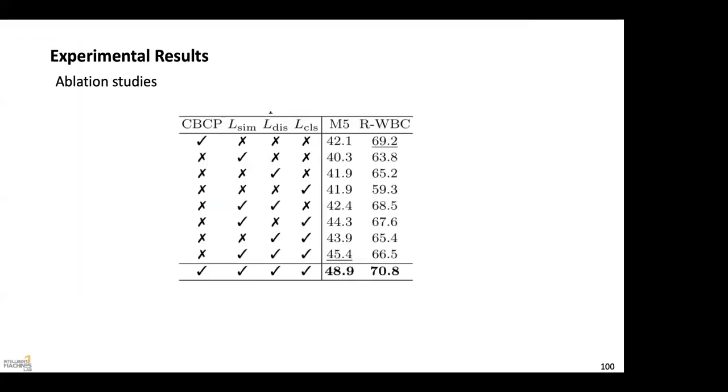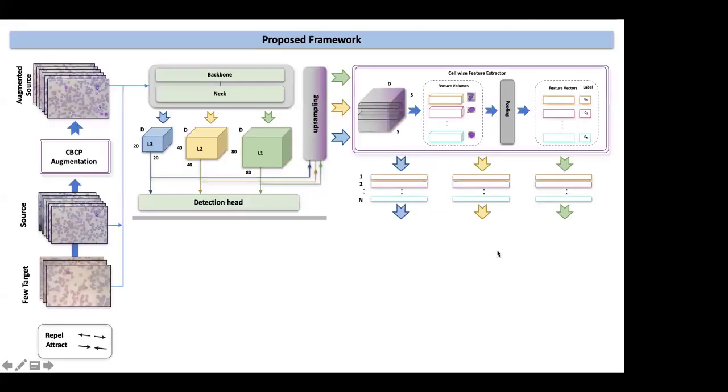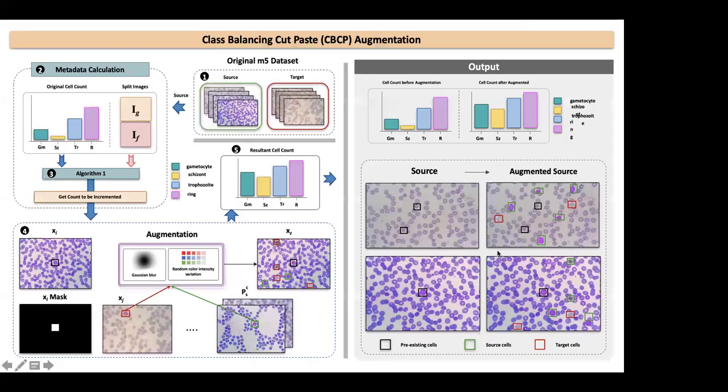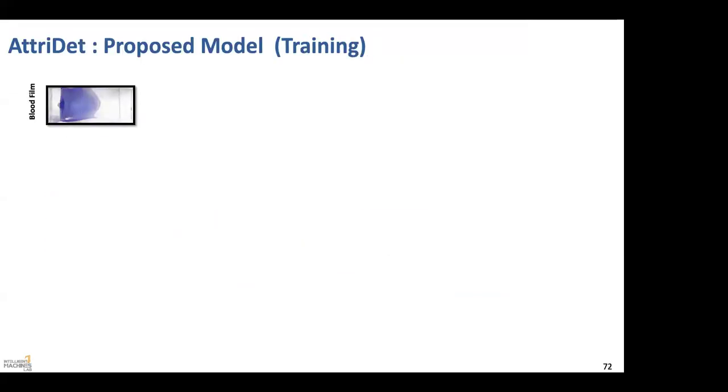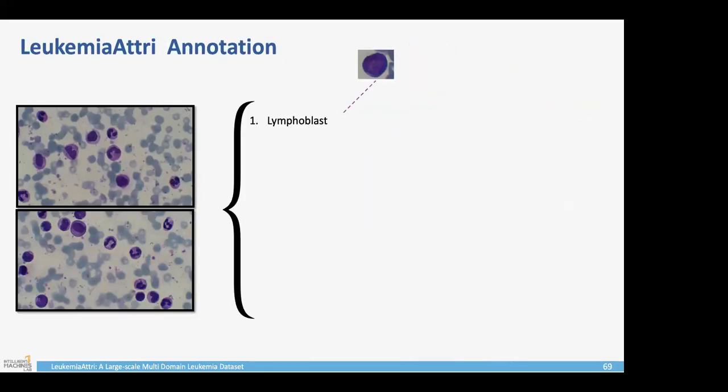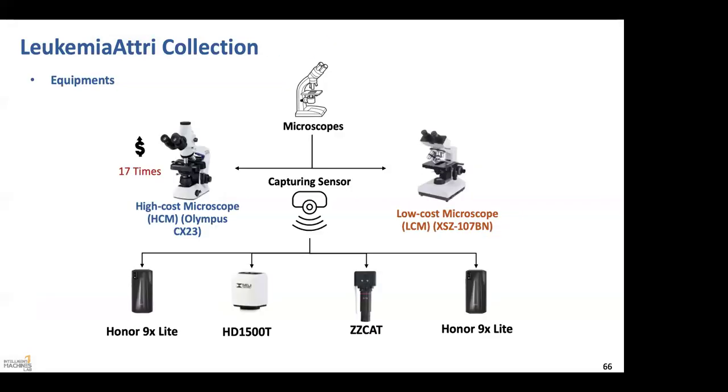So actually, in our case, we don't have that issue because we put a simple mobile camera over the microscope. Oh, sorry, I missed the start of the talk. Yes, so we put the camera here, and we also use the microscopic camera that comes with the company's microscope. That also saves in the PNG format. So that HD 1500 already has PNG output. Yeah. Thank you.